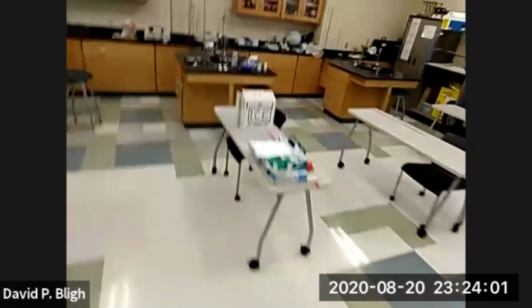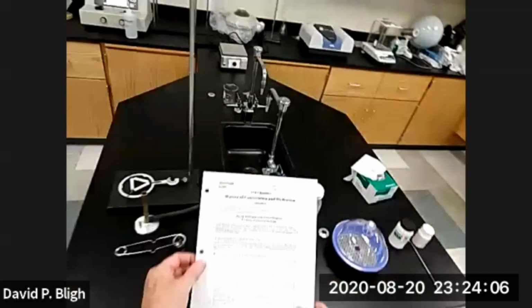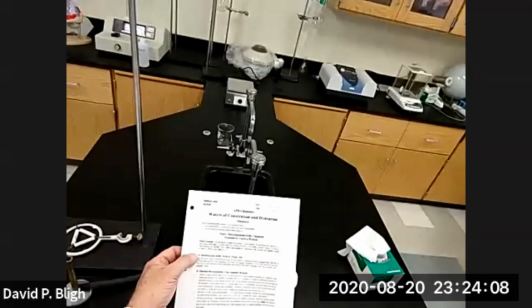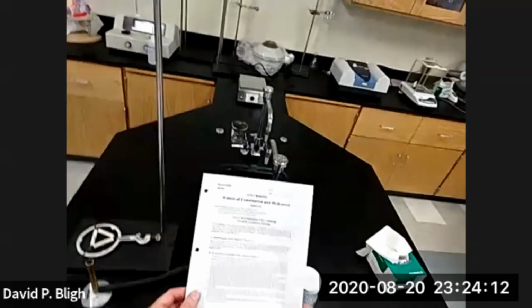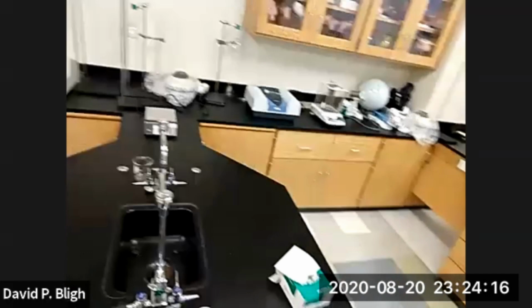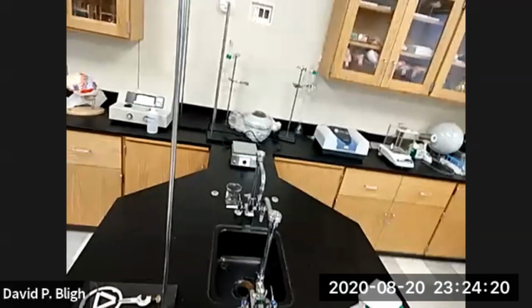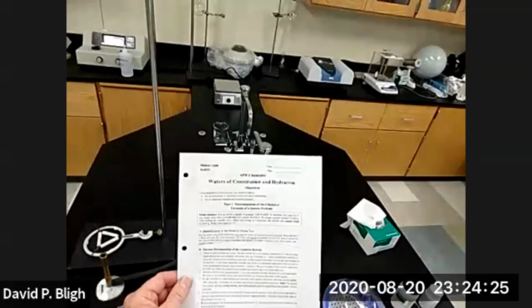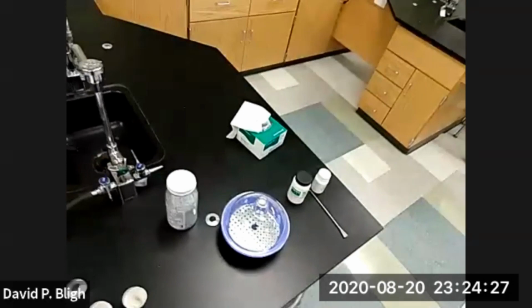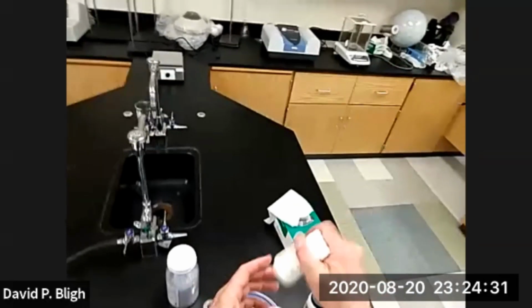All right. So the first part of the experiment is part B. We're skipping part A. And don't forget to do the pre-lab question. Part B is the thermal decomposition of an unknown hydrate. Well, the unknown hydrate, I'm going to tell you what it is. It's a hydrated version of copper sulfate. All right. So for this part, we need copper sulfate. And here it is, copper sulfate.